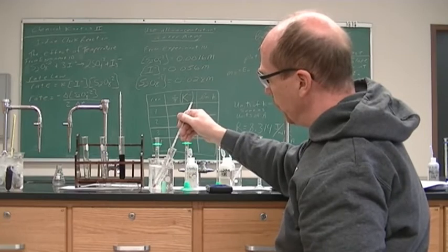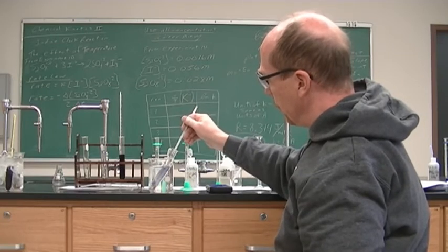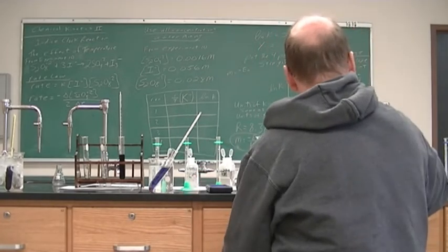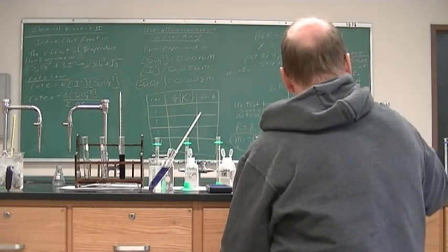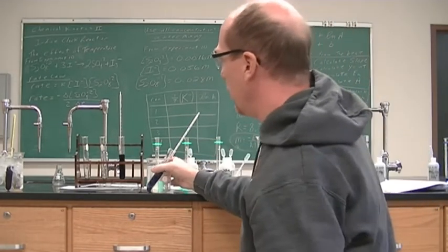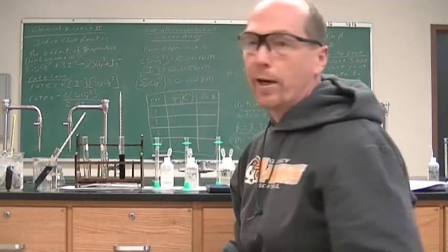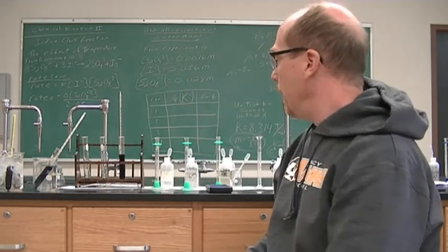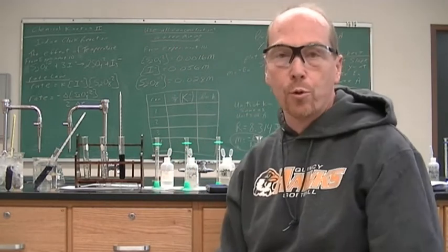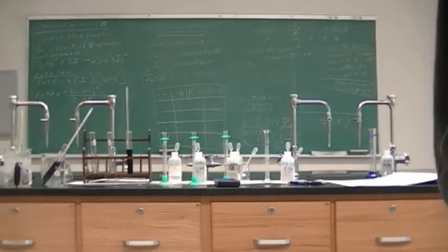really close to the time change that we're expecting. Yes, so 48 seconds. All right, and so then at 48 seconds, we have our final color change. All right, and so that was the experiment, was to do the same reaction 4 times at 4 different temperatures. All right, so let's go look at our calculations for this experiment.